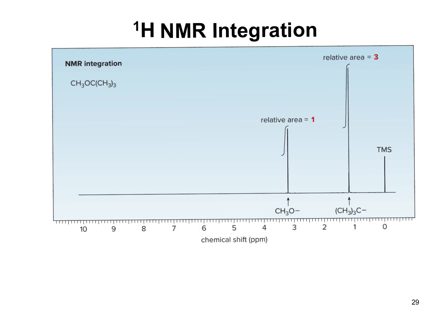Now, the NMR has more information to give us than just the number of chemically inequivalent hydrogens. For example, the relative intensity of the proton signal also provides information about the compound structure. The area under the NMR signal here is proportional to the number of absorbing protons. And an NMR spectrometer can integrate the area under the curve and print out a stepped curve shown here, or an integral on the spectrum.